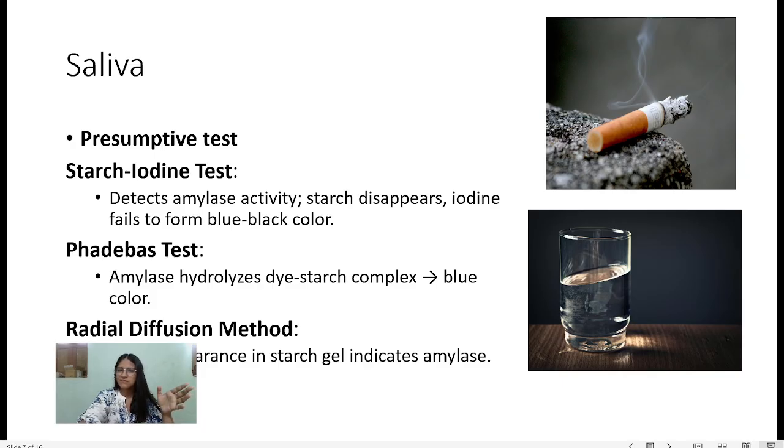Like as I have told you, this is a presumptive test, so we cannot confirm the presence of saliva just because of the color change of the material. So we have to move on to the confirmatory test to confirm the presence of saliva.